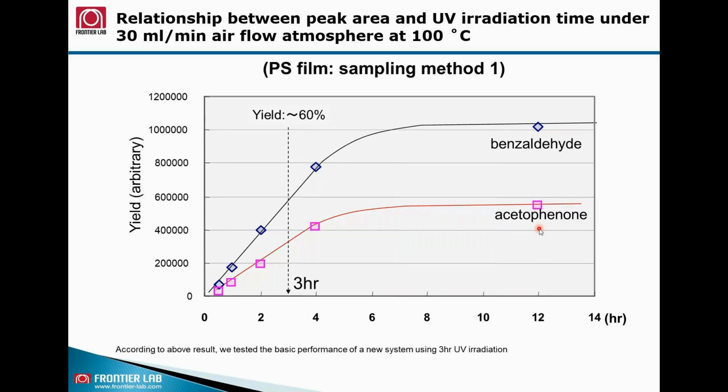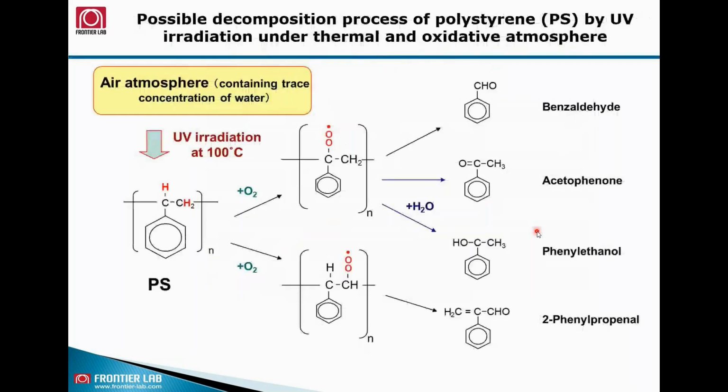So we can see there is a linear response. When you have more hours of exposure, it releases more benzaldehyde and acetophenone, which confirms the degradation hypothesis or the pathway by which we are seeing the larger portion of benzaldehyde and acetophenone.